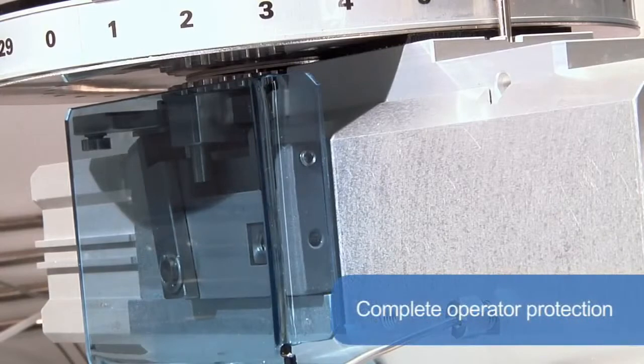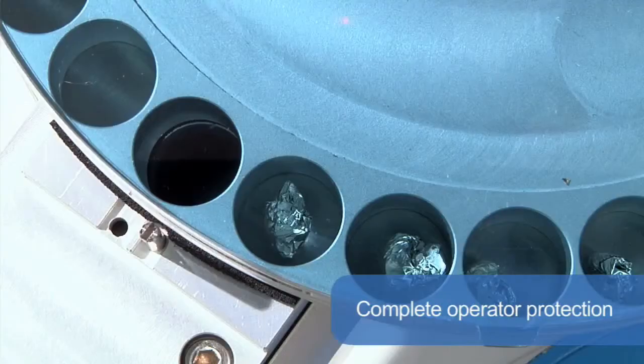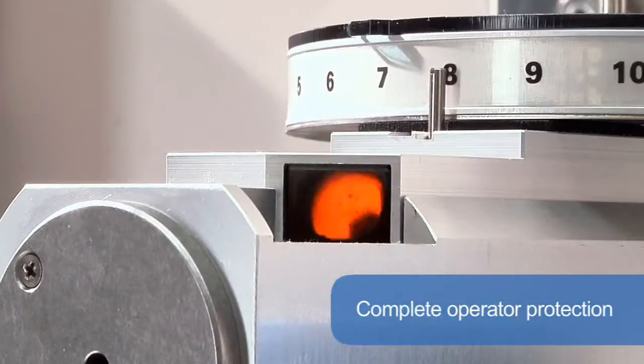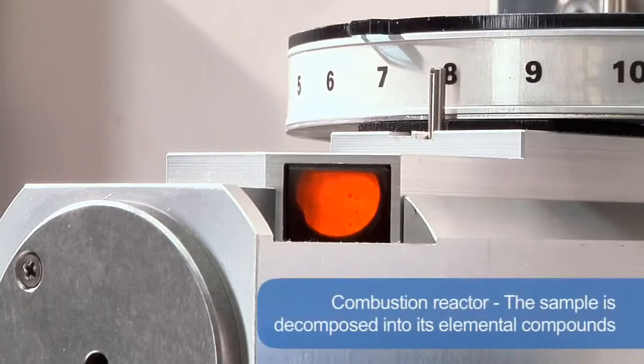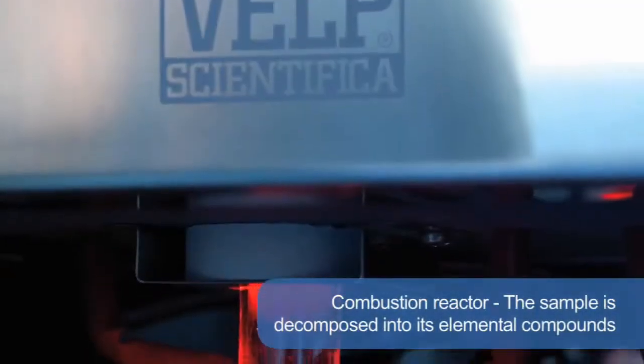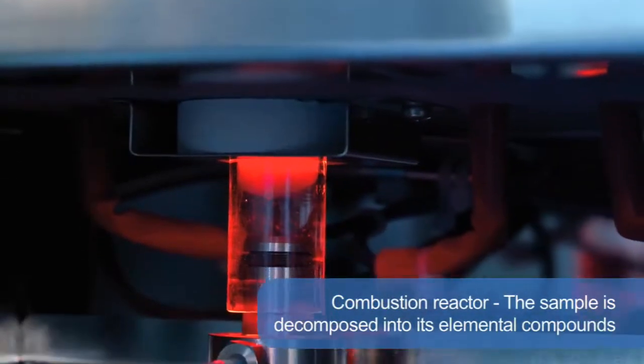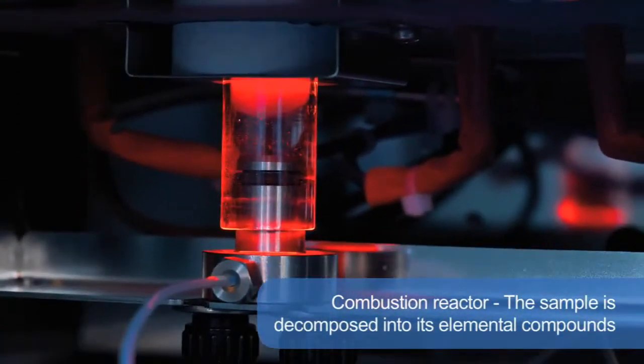The combustion reactor, filled with catalysts and in the presence of pure oxygen, ensures complete combustion. During the combustion at 1,030 degrees centigrade, the sample is decomposed into its elemental compounds, such as carbon dioxide, water, and several nitrogen oxides.